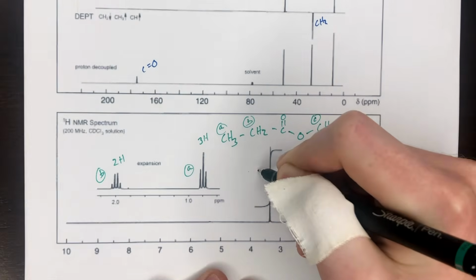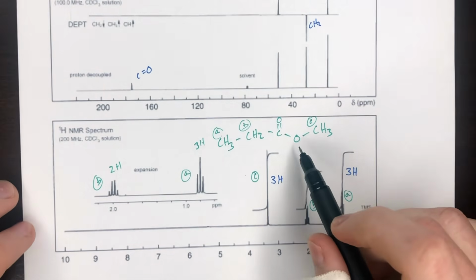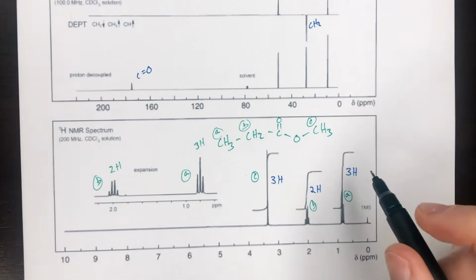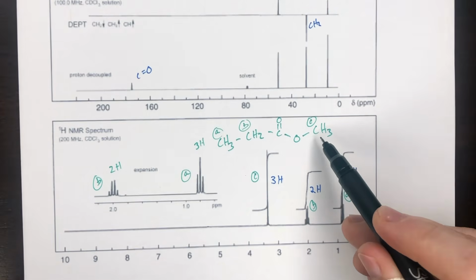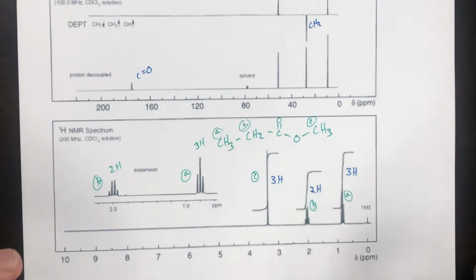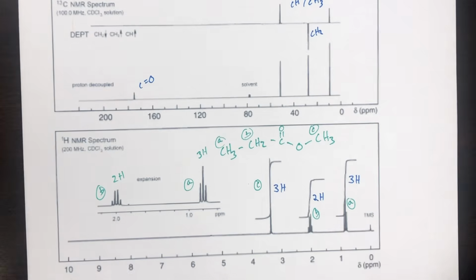right? So if you're wondering, could you put the CH3 and then the oxygen, because that would still be a singlet. The problem with that is simply that the carbon would have an expanded octet, right? If this was a CH3 bound to 2 things, that would have 5 bonds. That's impossible for carbon. So that's why that doesn't fit here.